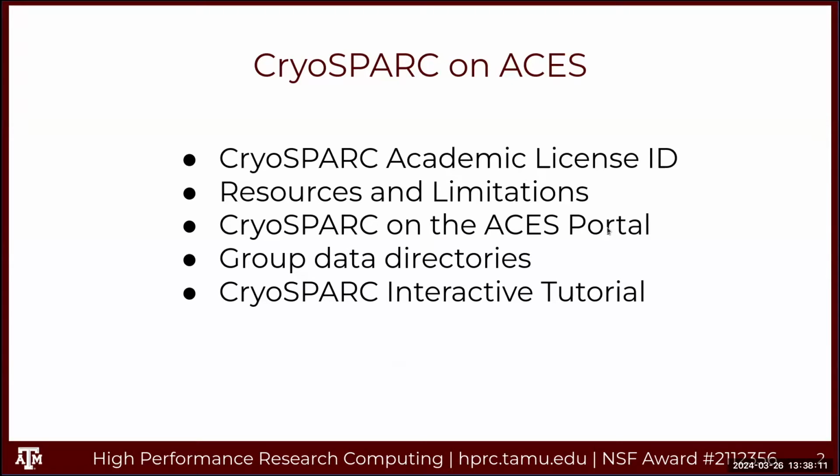Okay, so in order to run CryoSPARC, you'll need to get an academic license ID, and you can obtain this from the CryoSPARC website. I'll go over the resources and limitations for running CryoSPARC. We'll get started with running CryoSPARC, launch a CryoSPARC session on ACES. We'll talk about group directories, and then in the end, we'll have another speaker that will go over an interactive tutorial with some example image files.